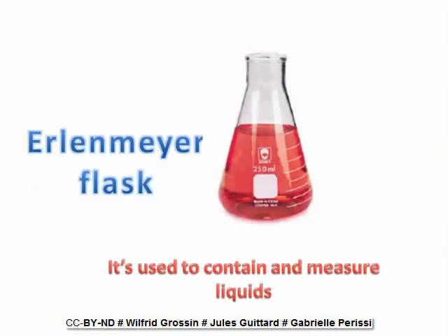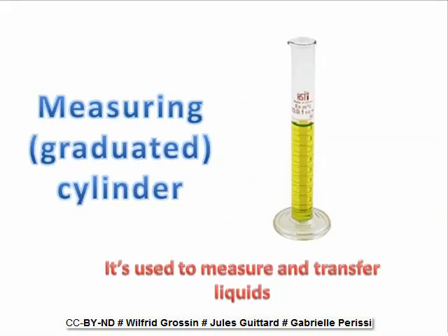Erlenmeyer flask. It's used to contain and measure liquids. Graduated cylinder. It's used to measure and transfer liquids.